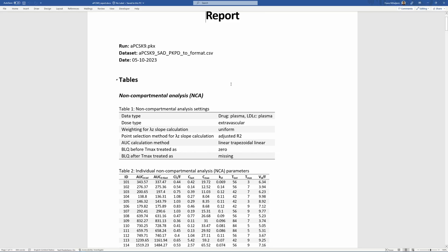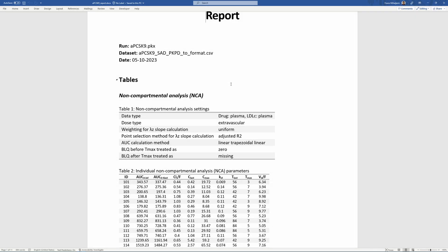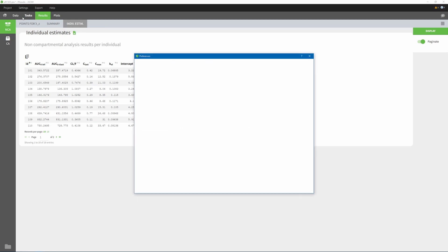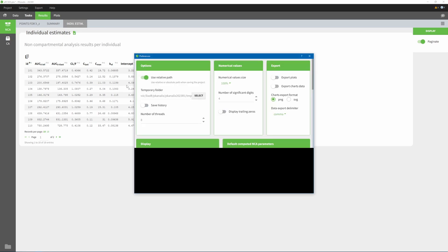You can notice that tables in the report contain NCA metrics names that are different from the default names in the interface. This is now possible thanks to the new feature that allows changing the names of parameters and how they appear in tables, plots, and reports.